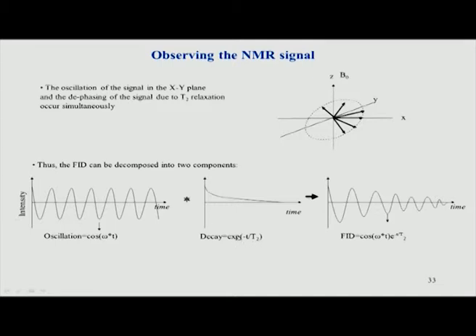And so on. So this is how the exponential decay is depicted. Now this is a decay, but the oscillation is captured here. The oscillation of the FID is because of the rotation of the spins in the xy plane, because they are precessing around the z axis. That precession, which is the Larmor precession, is what is shown here. This is nothing but a Larmor precession shown in a simple sinusoidal, oscillating manner, which is a simple sinusoid function, cosine of omega t.